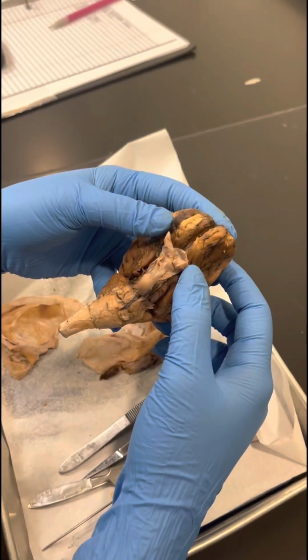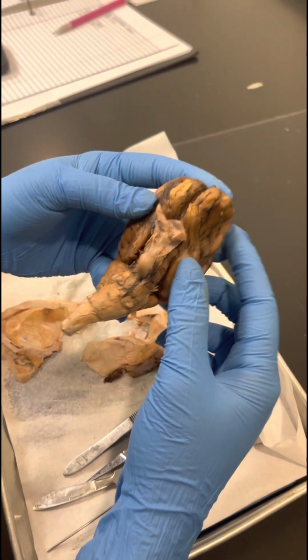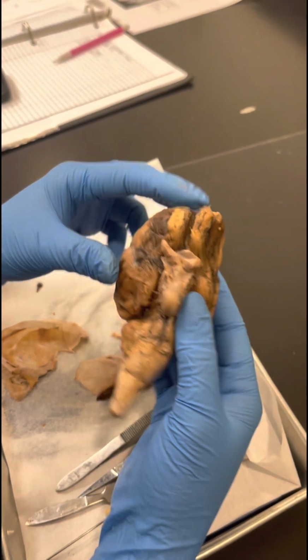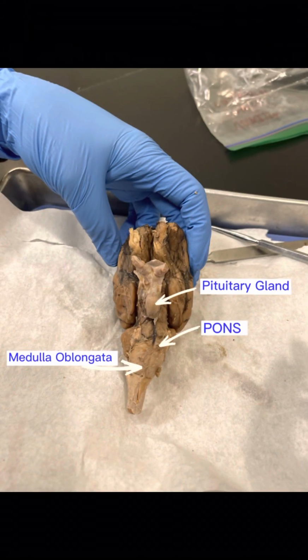We will now be discussing the 3 different locations on the inferior portion of the sheep brain. Next, we will be looking at the pituitary gland. Your pituitary gland, also known as hypophysis, is a small pea-sized gland located at the base of your brain below your hypothalamus. It's a part of your endocrine system and is in charge of making several essential hormones. Your pituitary gland also tells the other endocrine system glands to release hormones.